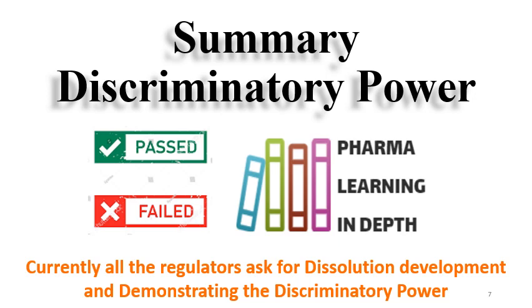If you are using a monograph method like USP monograph or other pharmacopoeial monograph methods, still you have to show the discriminatory power. Otherwise, you have to develop a specific method which is discriminatory and which can reject the bio-inequivalent batches. So this is regarding the discriminatory power for dissolution testing.